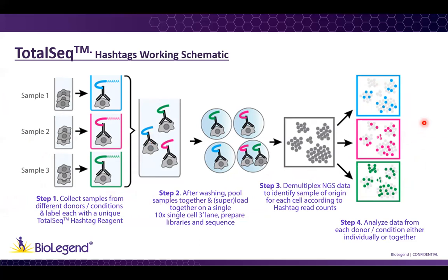And here is where I want to show you how hashtags can help you identify droplets containing more than one cell, and then these reads can be excluded from your analysis, helping clean your data.